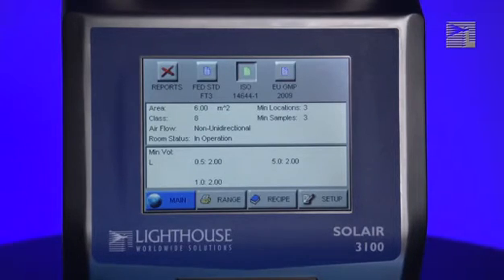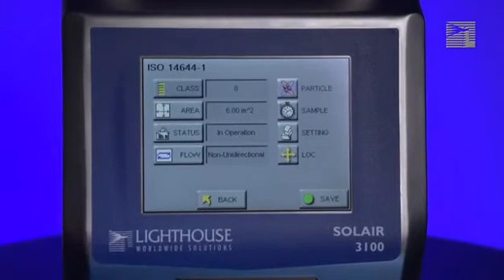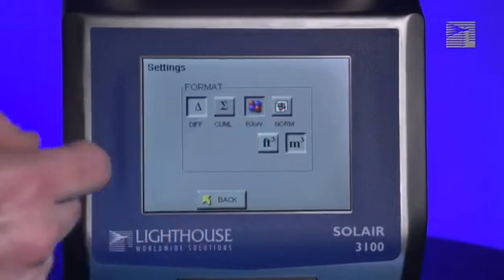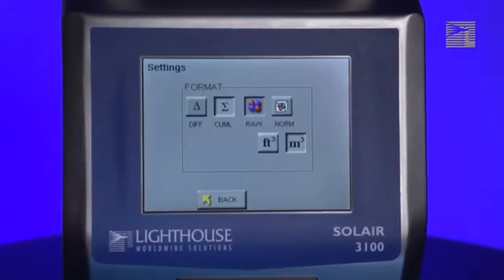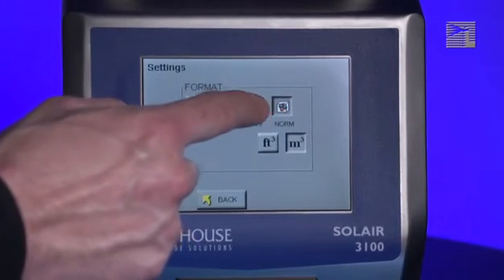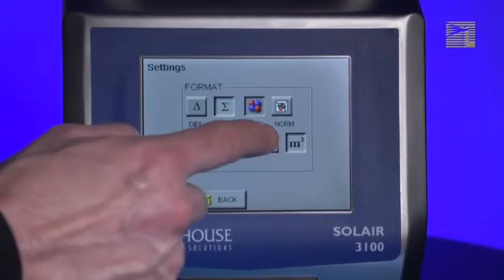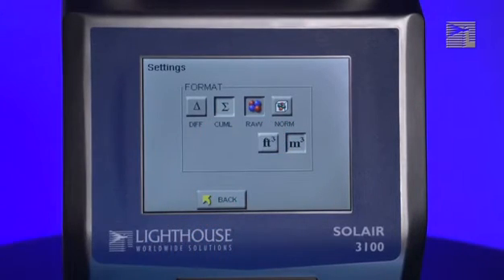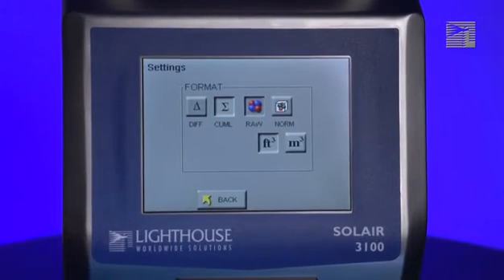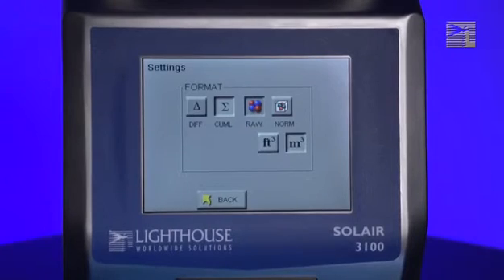To continue setting up the report, press the Setup button again. The calculating mode may be set via the Settings button. All supported cleanroom standards require the counts to be collected in cumulative mode. Selecting raw or normalized counts or selecting display units of cubic feet or cubic meters changes how the particle counts are displayed, but does not change the validity of the report. However, to avoid confusion, select cubic feet for display units when running the Federal Standard Report, and select cubic meters when running ISO 14644-1 or the EUGMP report.